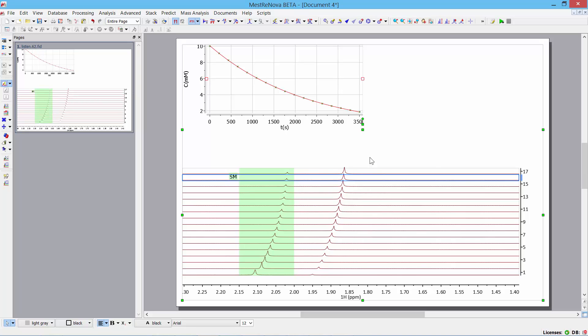So, there you have it. This is the listener in MNOVA. And it's very useful, I believe, for looking at real-time reaction monitoring. I thank you for your attention. And please feel free to visit the Mestrelab website for further information with regard to the reaction monitoring. Thank you. Bye-bye now.